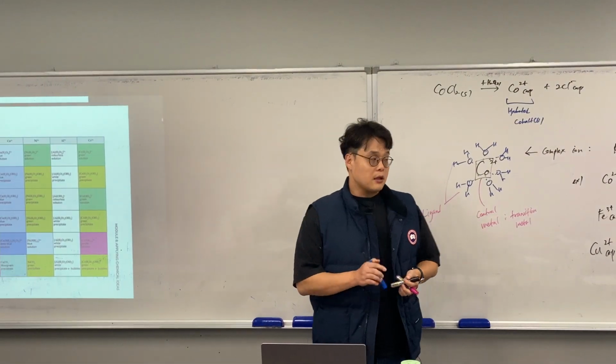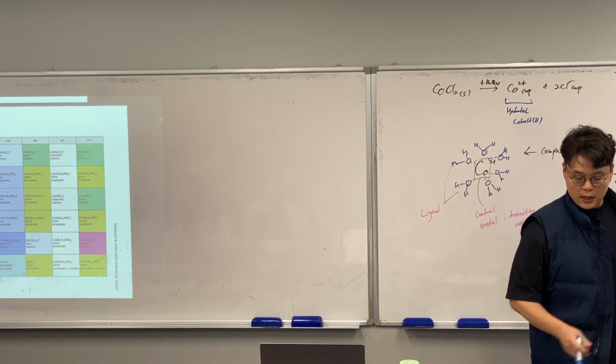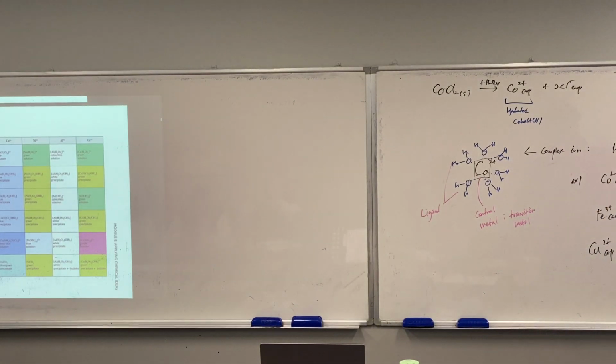All right. Then let's have a think about what happened between here. We have then cobalt water. So as you can see, this is basically telling you I have a cobalt which is hydrated here. What if I add some hydroxide into it? Let's have a look at the reaction between this. So I'm going to add some sodium hydroxide into cobalt 2 chloride solution here again. So see what happened.